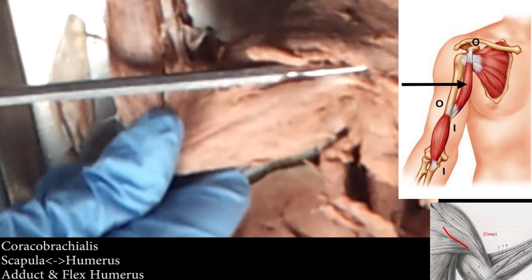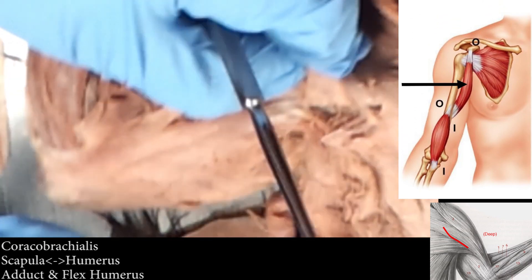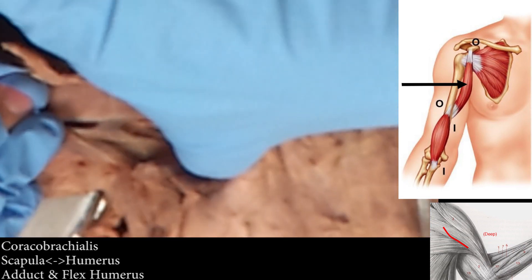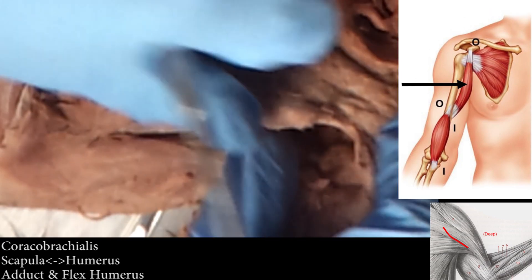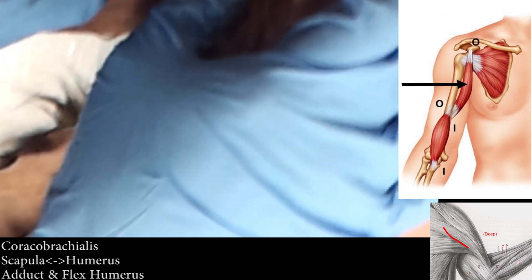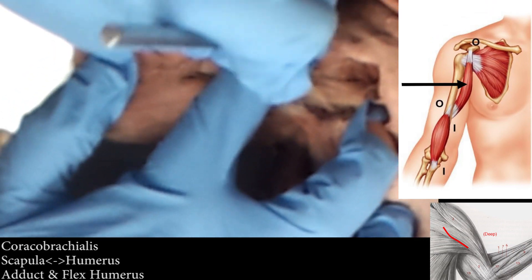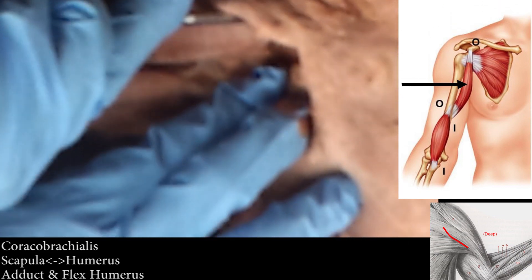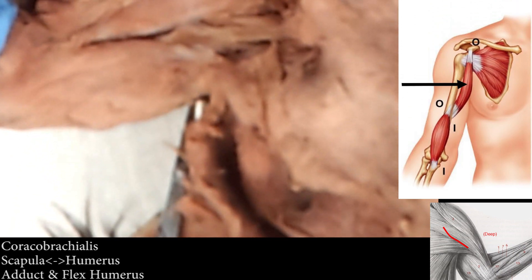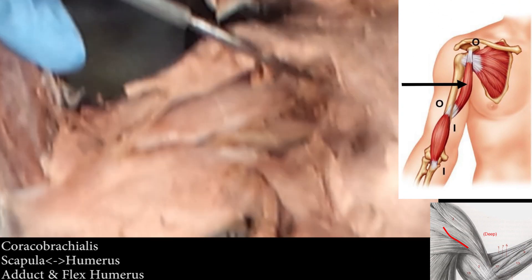To get to coracobrachialis, you're actually going to have to cut your pecs — that's why I said only do this on one side. You're going to get in here and go all the way back to the armpit. Open it up, and there's this itty-bitty tiny muscle right at the back of the bicep. It's this little strap — it's just tiny. See where the probe is? The probe is under coracobrachialis. So it's this itty-bitty muscle — if you have a probe in the armpit, it's coracobrachialis.